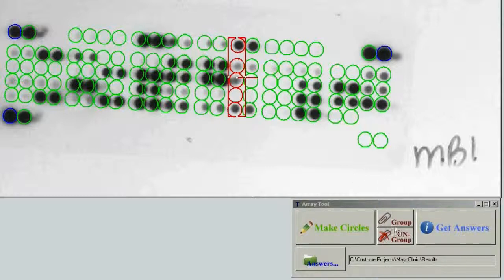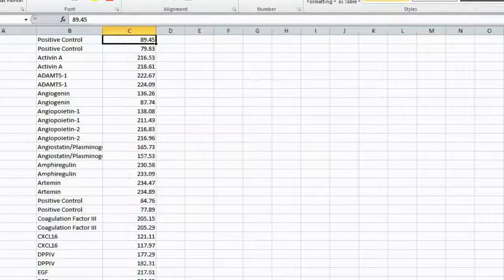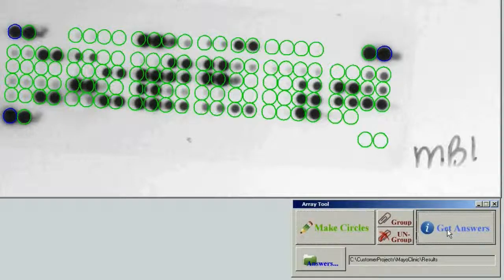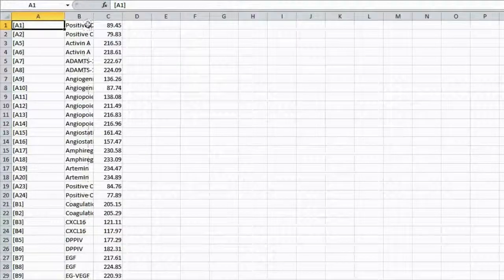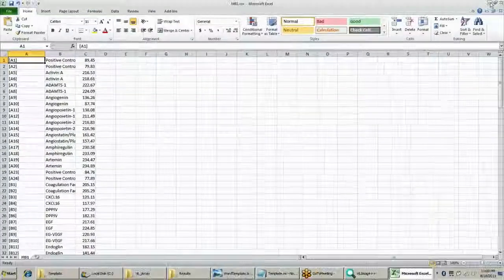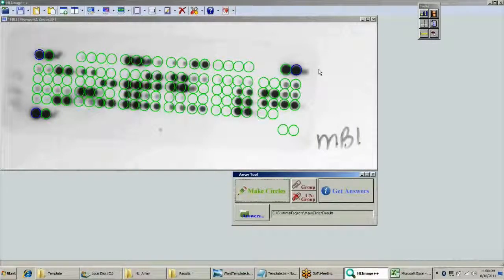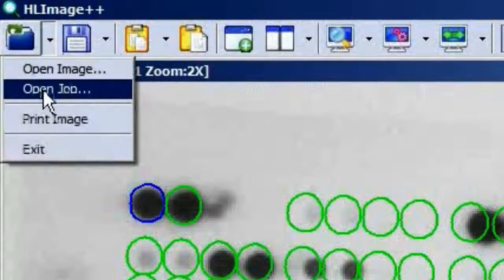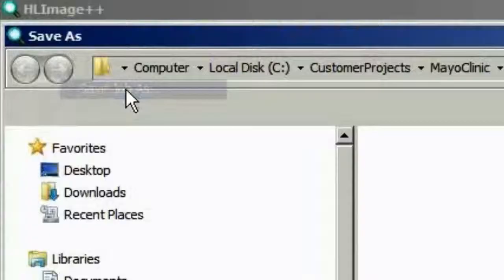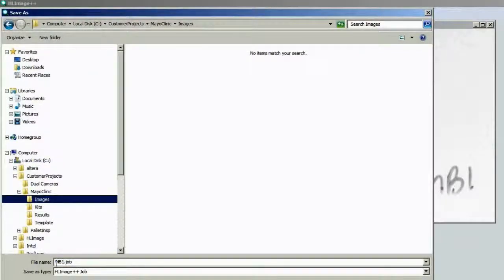After all your circles are aligned with the dots, close Excel because we're going to overwrite that file. When your circles are satisfactorily aligned, simply click Get Answers and OK to generate the comma-separated value file, which can then be opened in any spreadsheet such as Excel. If you were aligning circles and wanted to close your computer and come back later, you would want to save your work as a job file. The job file includes the image, the calibration object, and any ROIs on the image. Go to Save Job, put it in with your images — it has the same name as the image but with the .job extension.